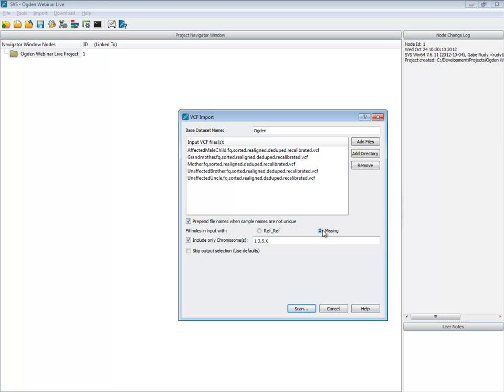We're going to fill those in with missings, which is just a personal preference, because we don't really know whether that hole is from low coverage or whether it was referenced there. For the purposes of analysis, it's all going to look the same, but just keep in mind, missing essentially means that sample most likely matches the reference at that position.